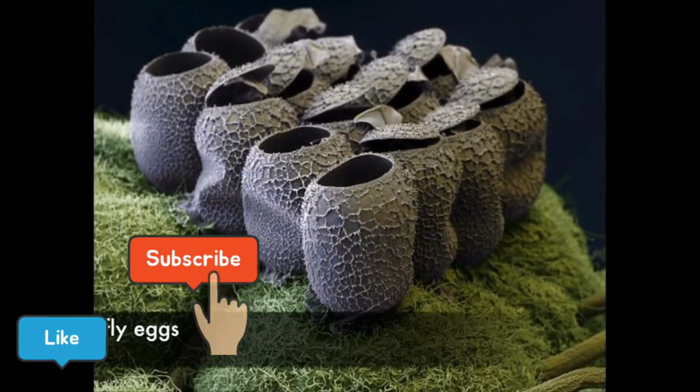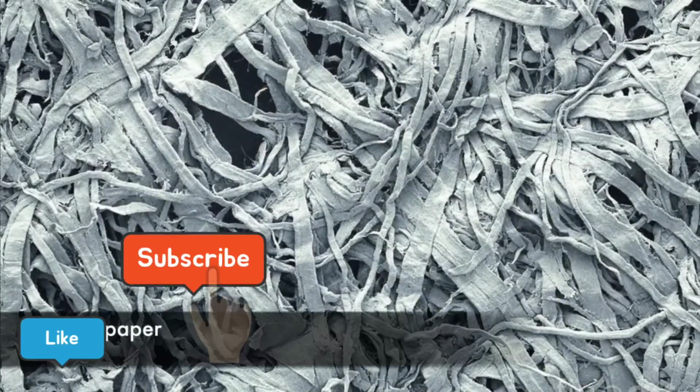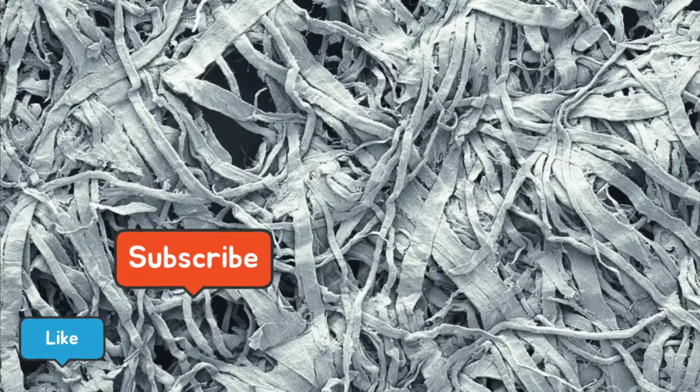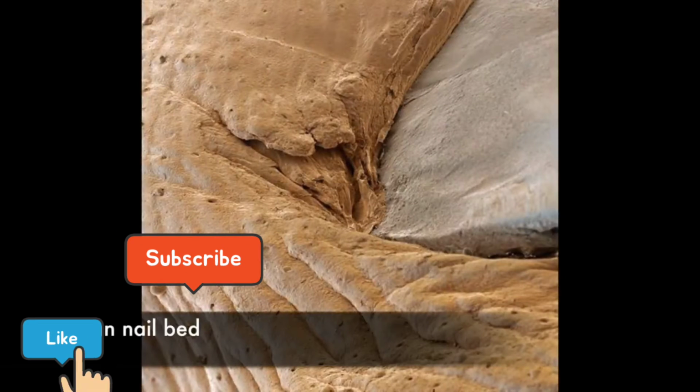A clutch of butterfly eggs sitting on a raspberry plant. A mesh of fibers from 2-ply toilet paper showing the microstructure of cellulose fibers. Paper mostly consists of a mesh of softened and pulped wood fibers. A human nail bed.